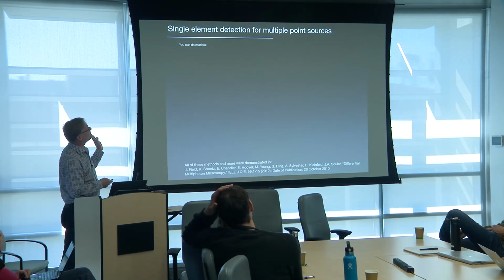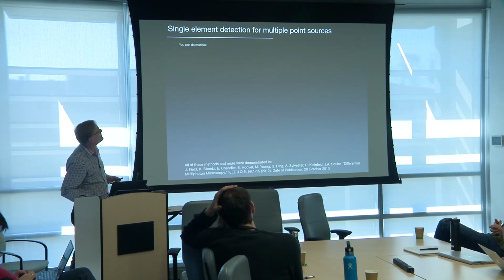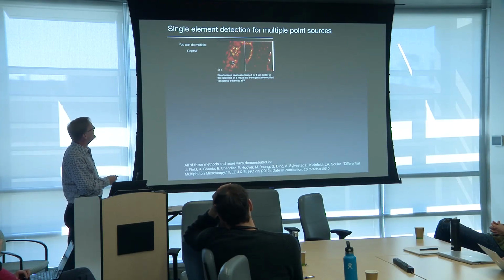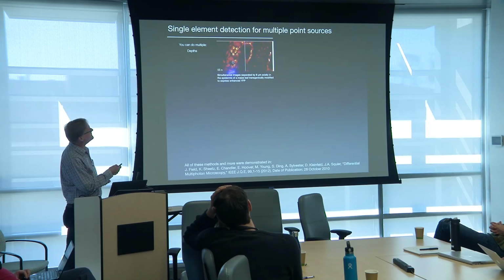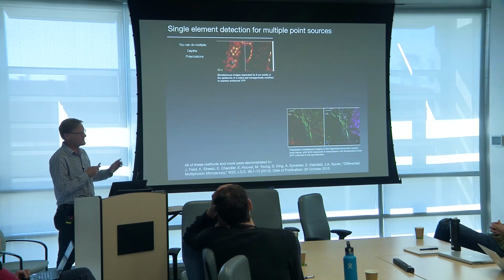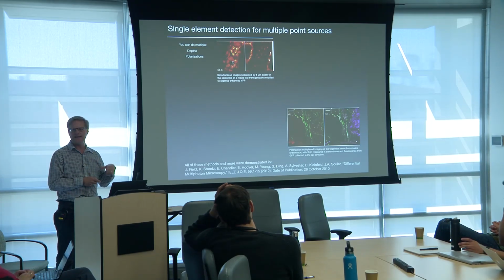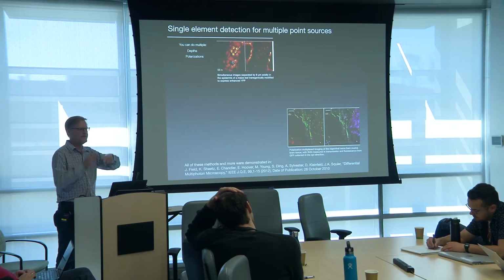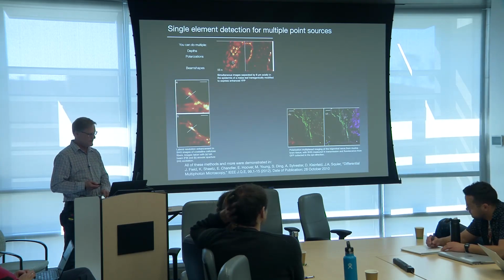And then we had a lot of fun with this because now with these extended beams, you could just do all kinds of things. So we could do multiple depths. I'm just showing a couple of the beams. We add defocus to one arm relative to another, and now you can do simultaneous multi-depth imaging. You can think of every possible iteration. So here we did simultaneous second harmonic, third harmonic at multiple polarizations simultaneously. And you get just amazing contrast by just having the polarization of these harmonics in the different arms.